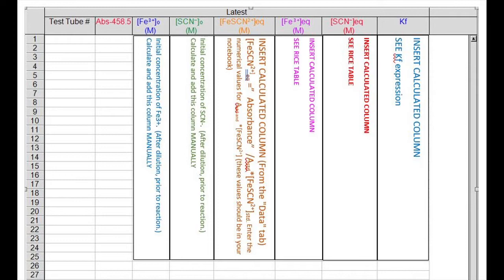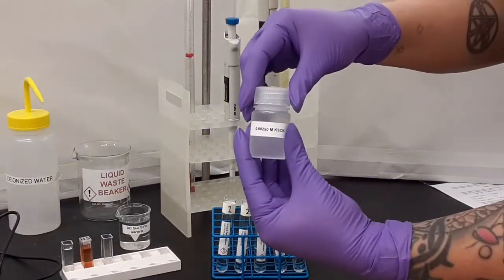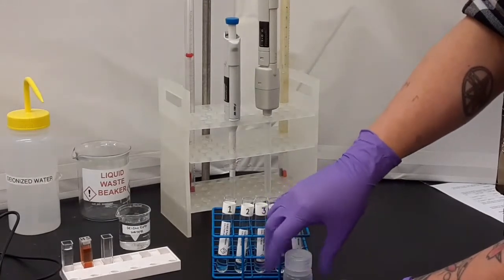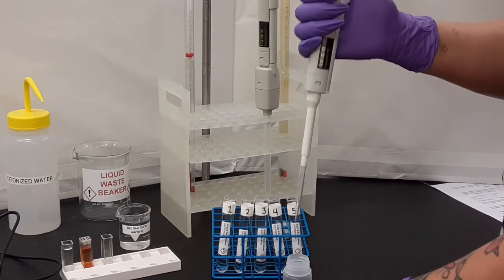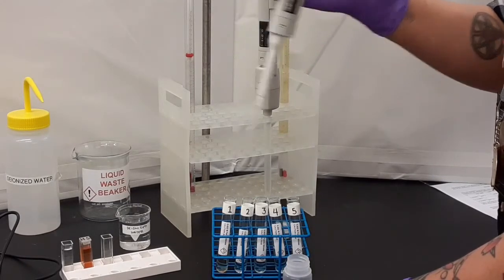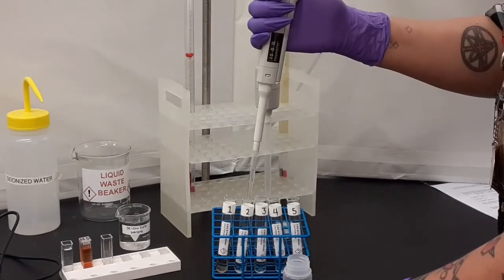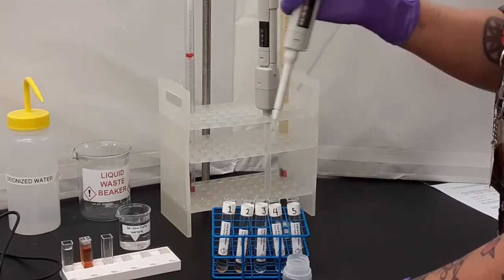And now Heather is going to show you how to prepare your sample series. So you've done this before. This is our second bottle of reagent, the potassium thiocyanate. We have the 1 and the 5 milliliter pipette. You could use either one of them to accomplish all of this work. Heather has chosen to do what she did before, which is to use the 1 milliliter pipette for her thiocyanate reagent. So she's going to carefully pipette the requisite number of aliquots into each tube in a series.